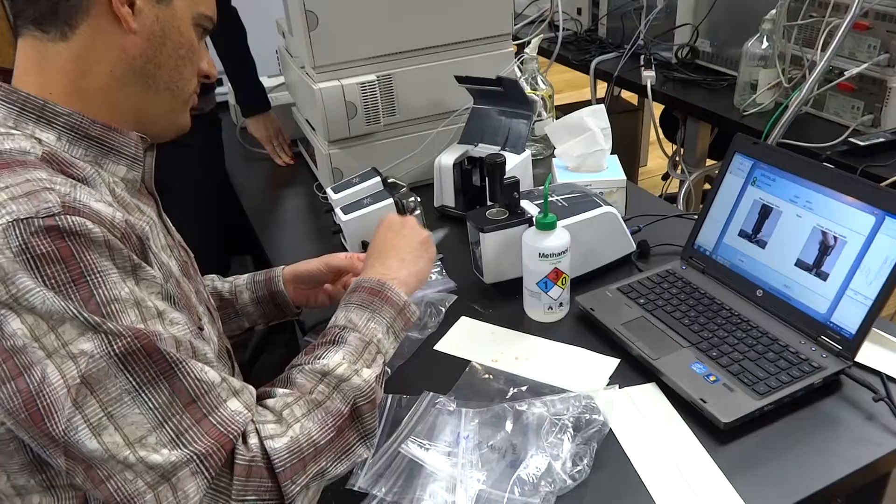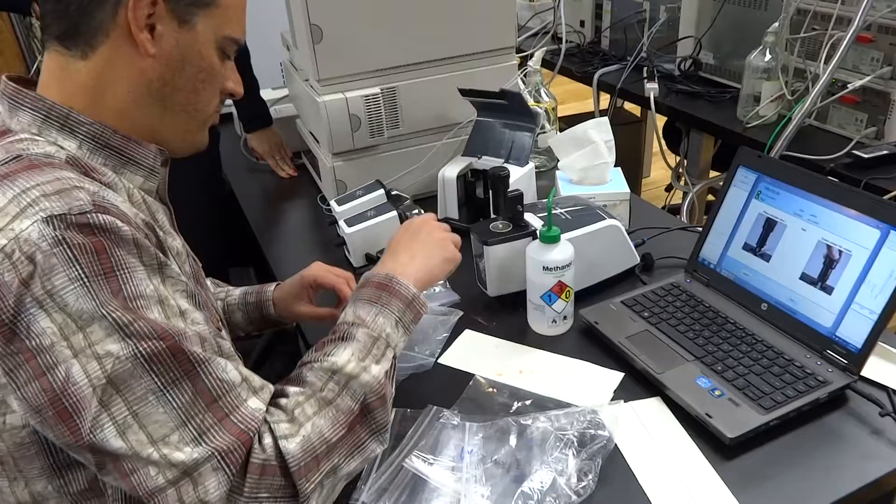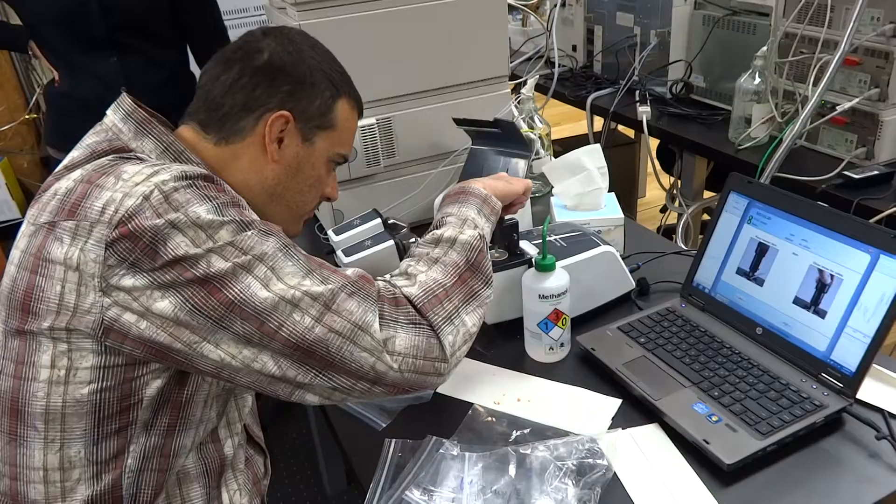So this came out, you said, a few years ago? September, yeah, September. So it'll be like a year and a half. A little bit less than a year and a half. In September it was one year last year. And this one was an Agilent design. Yes. It's strictly Agilent, yeah.